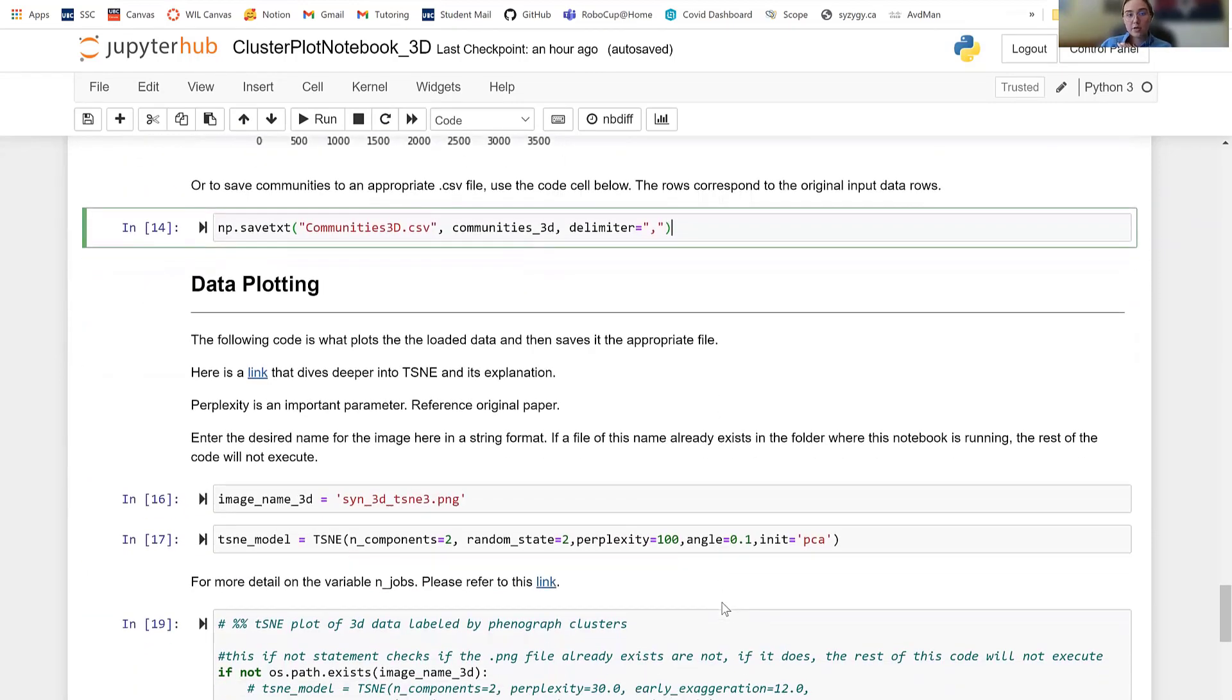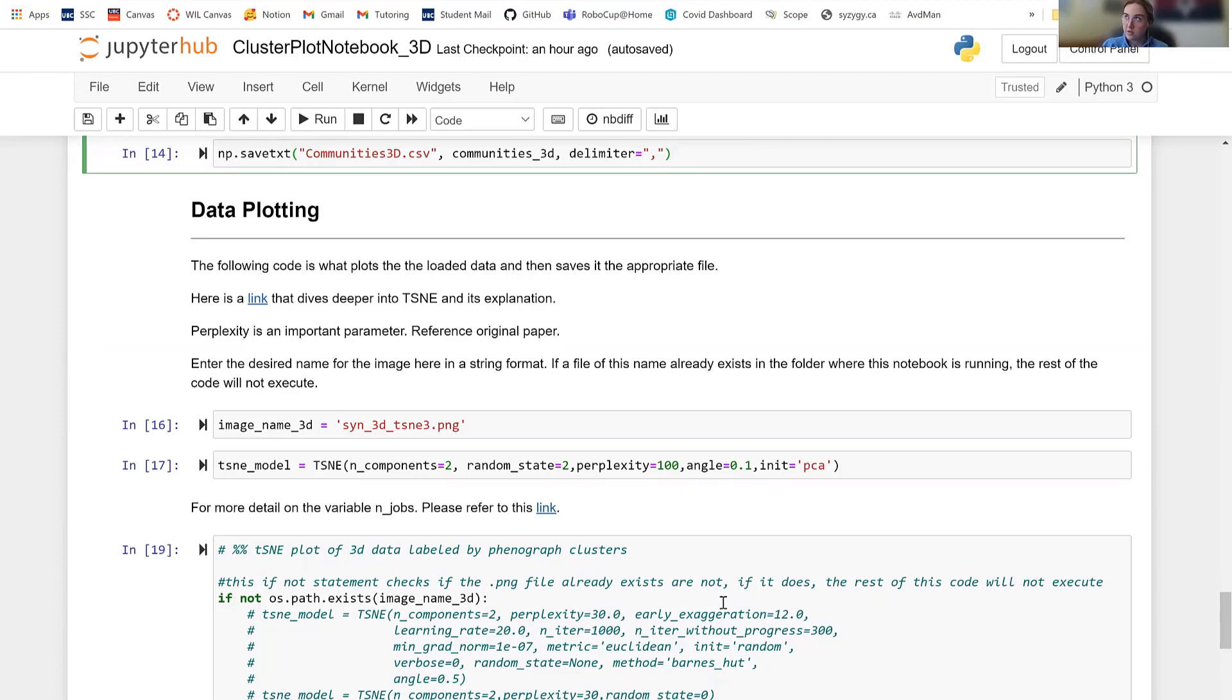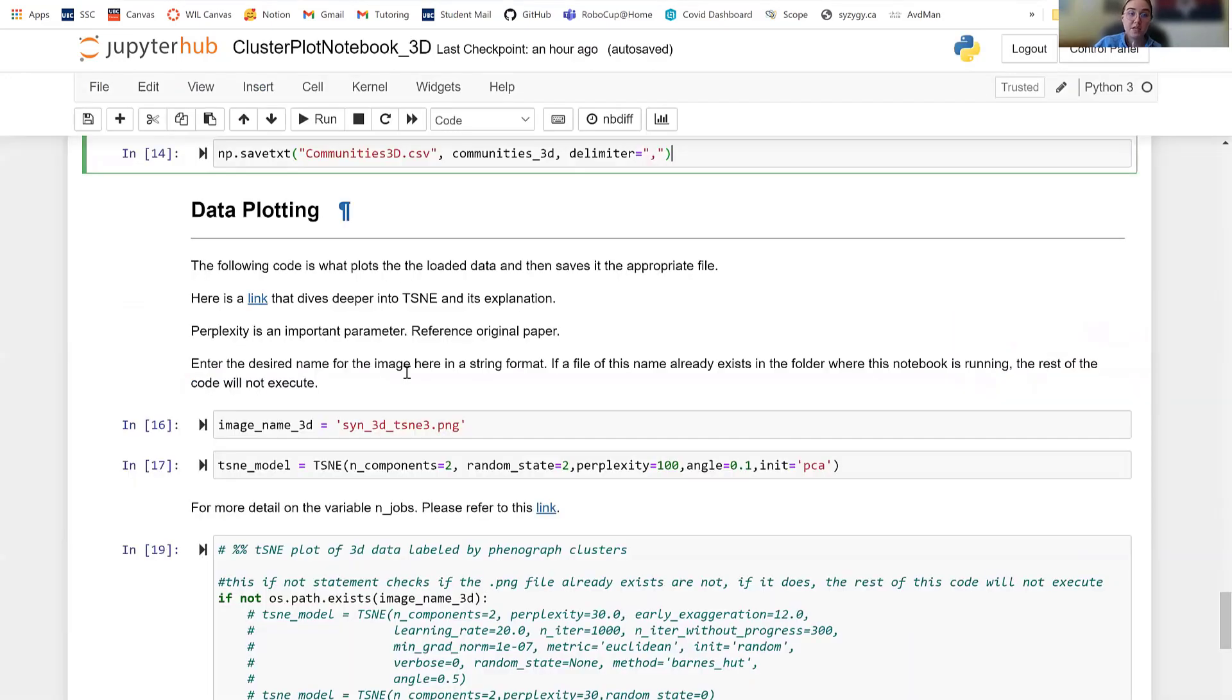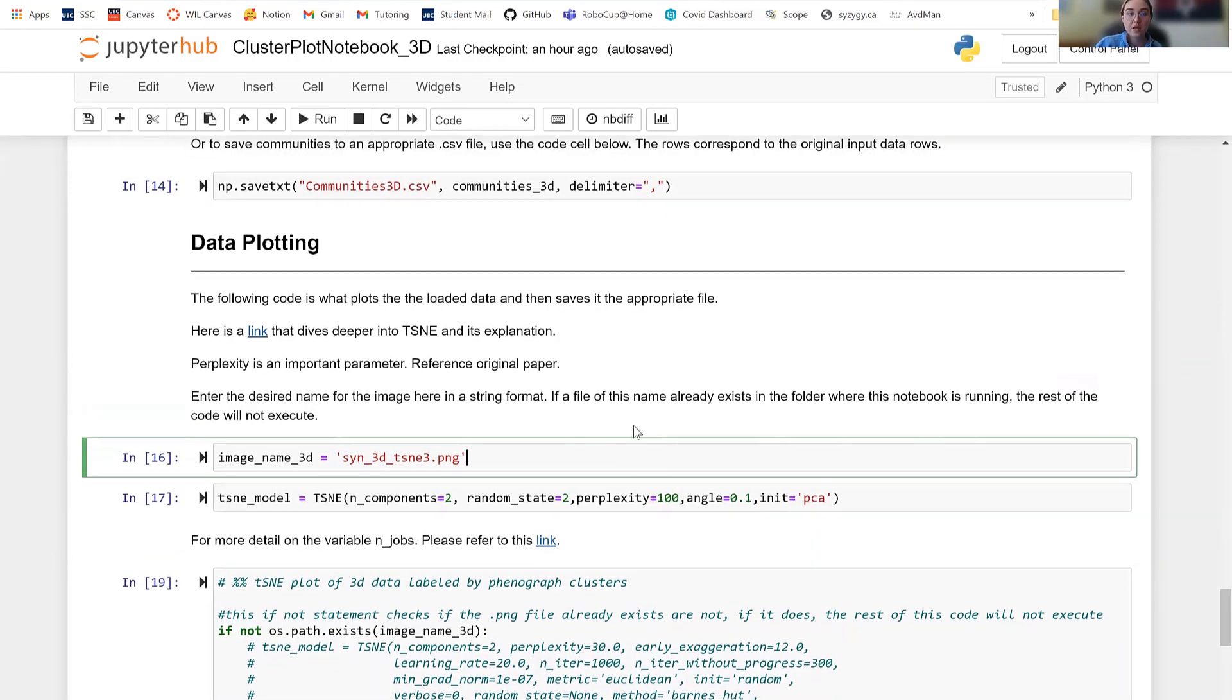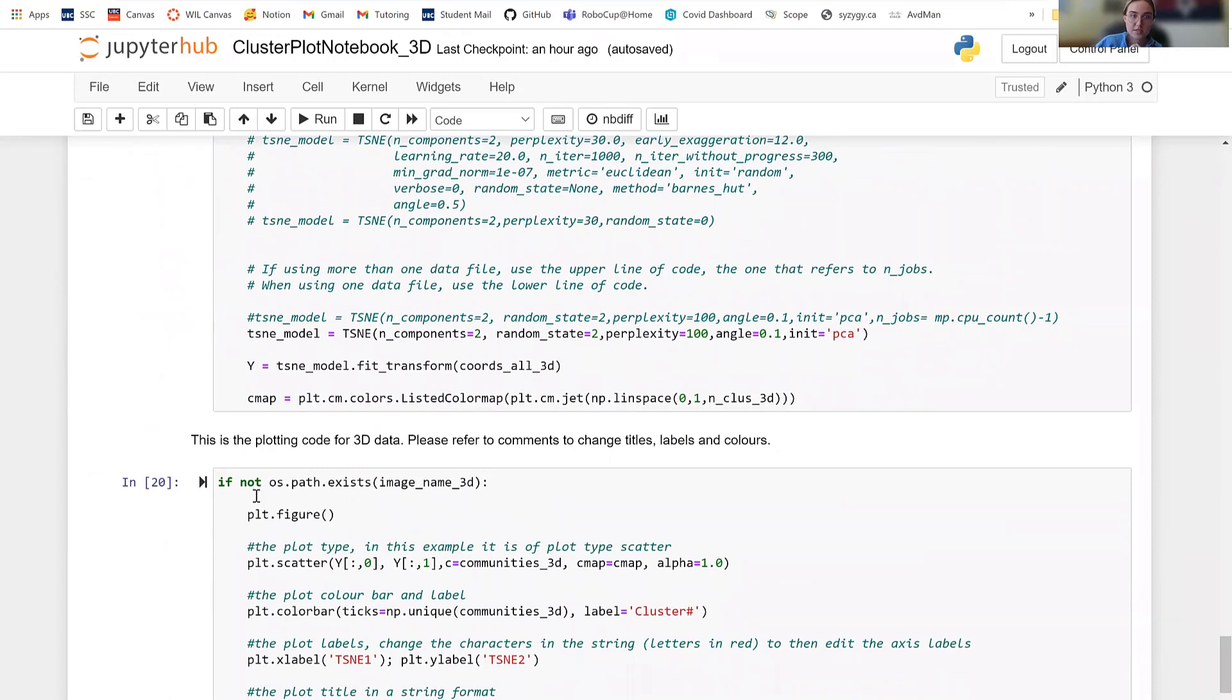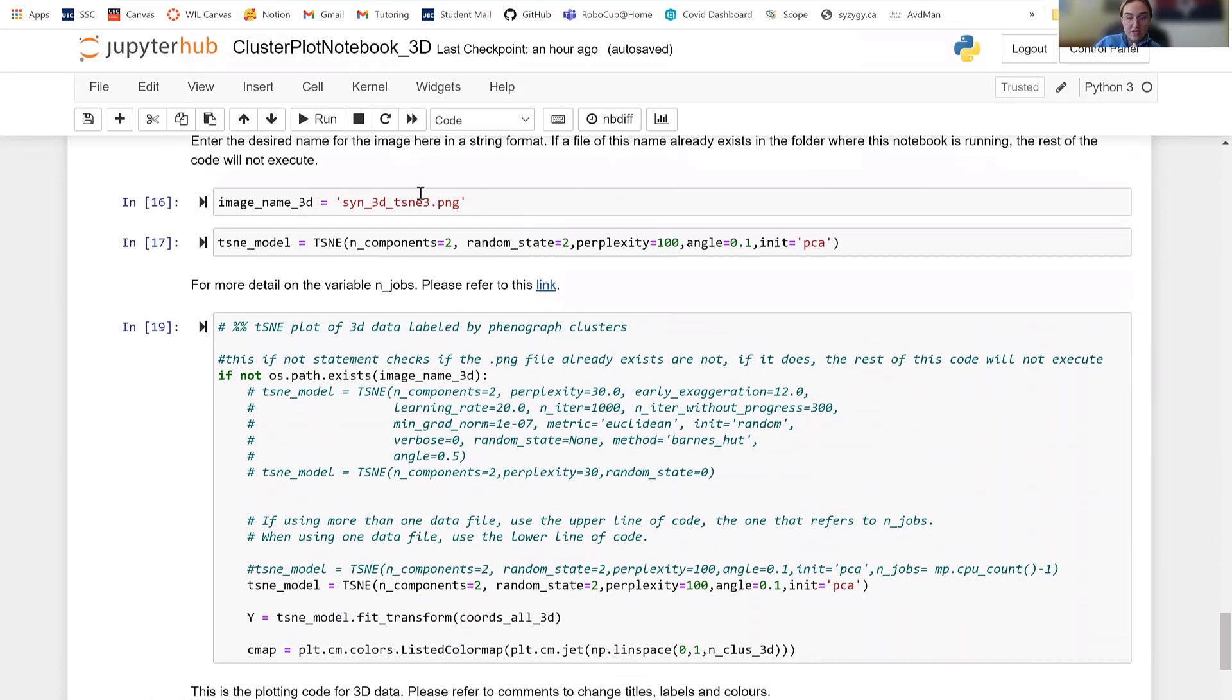So here we're going to data plot. So we're going to plot our clusters into a nice image. I've already ran this code before because it does take a couple of minutes. It's important to note at the beginning of the file that I note what CPU and sort of RAM you should be running this with because especially if you're running multiple different data files, this can get pretty heavy on the computation side. So that is important to note. So I already have this image. So this code actually wouldn't even run if I tried to run it because I have this name here. So this is the name that your image is going to save under. If this image already exists, none of these code, none of these code blocks will execute because they're always checking if not this image exists each time.